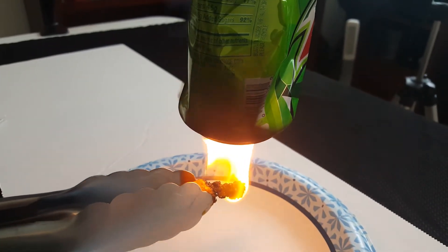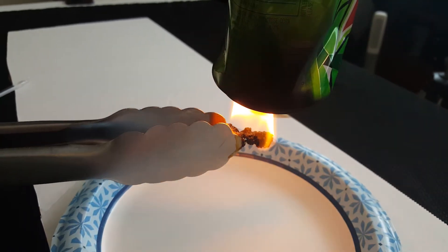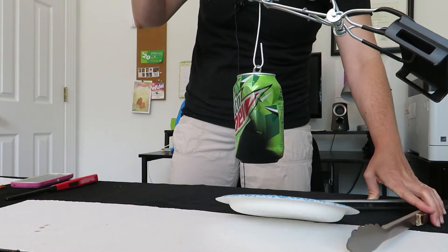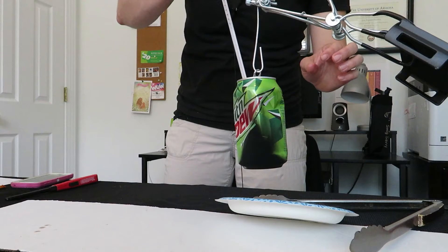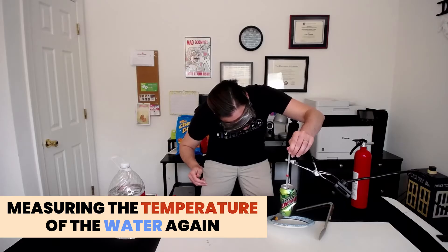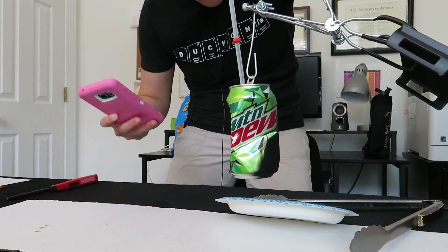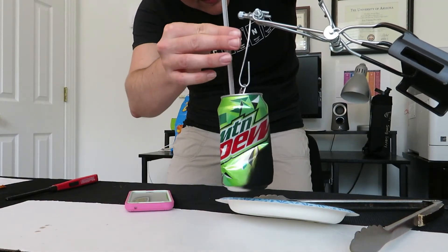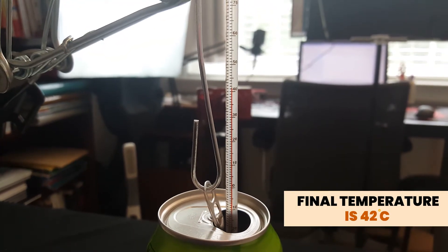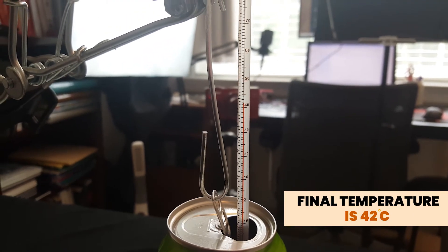And this is the exact reason why using a disposable can is really great for this lab. The cheese puff has come to a final resting state. When you're measuring the temperature, try not to have the thermometer hit the bottom of the can — you don't want it to read the heat on the bottom of the can, just the temperature of the water itself. Looks like it's gotten all the way up to 42 degrees Celsius. Now it's dropping again because it's cooling down, but at its hottest temperature it was 42 degrees Celsius.